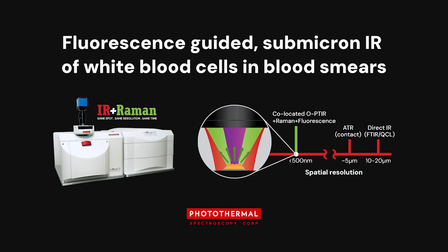We also studied in the past O-PTIR data from tissue sections on glass, and for this homogeneous tissue section, the glass background was fortunately also quite low.